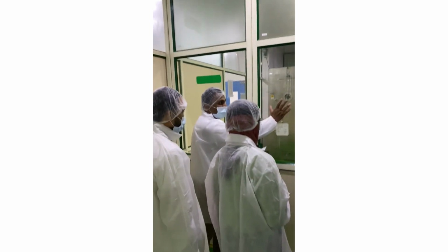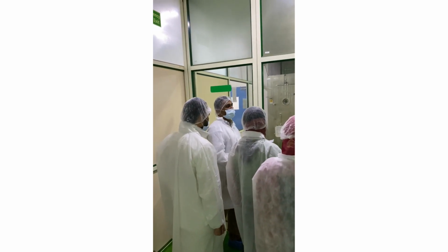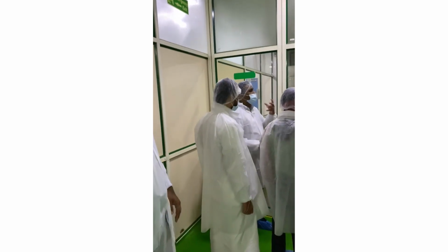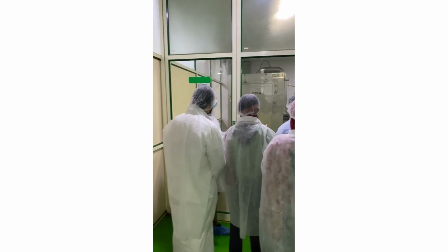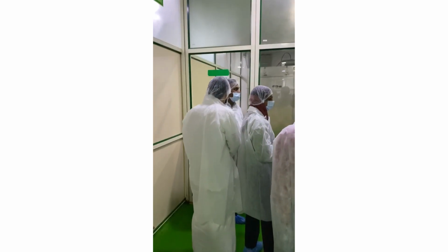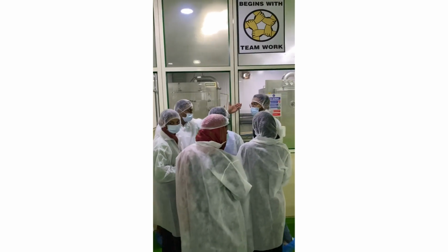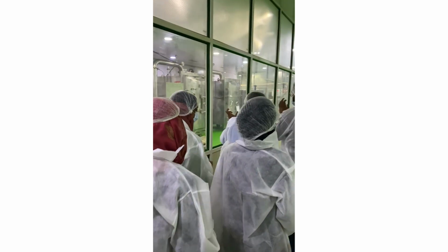Dryers. Here we do drying of raw material, which is being used for the products, to remove the moisture and microbial load. These are the dryers that will go for the cycle.